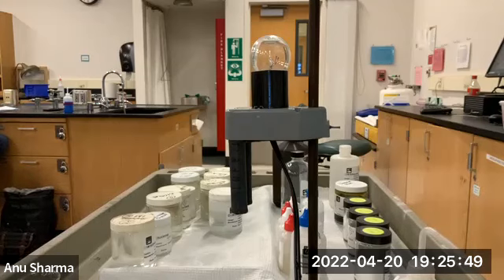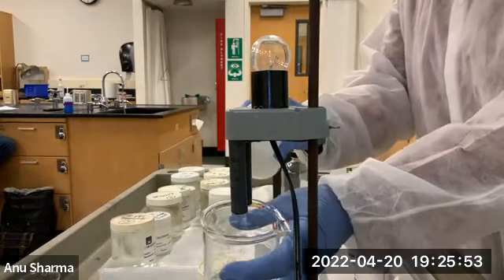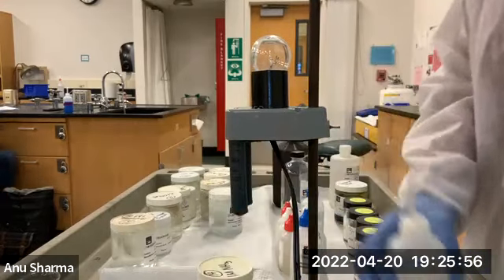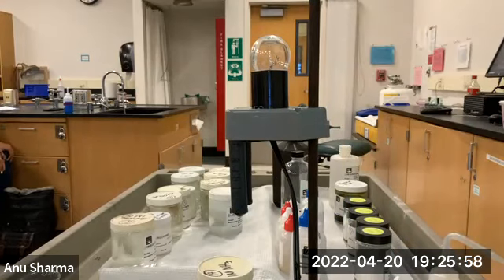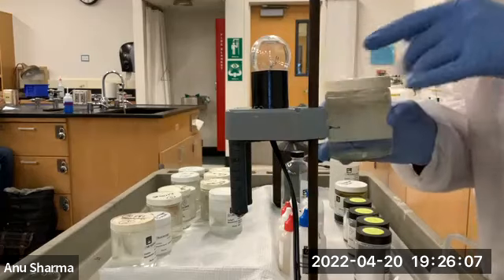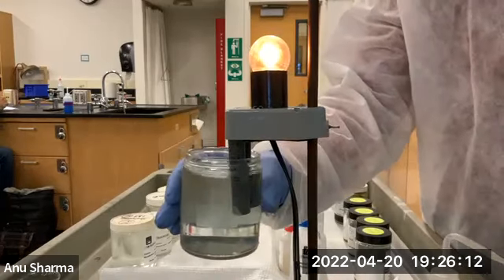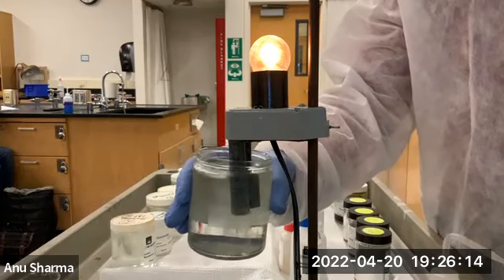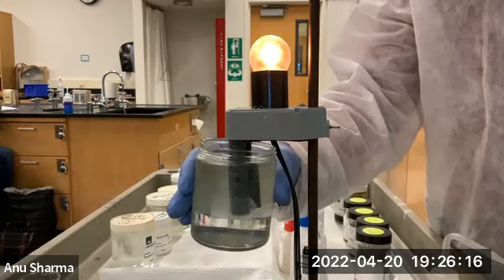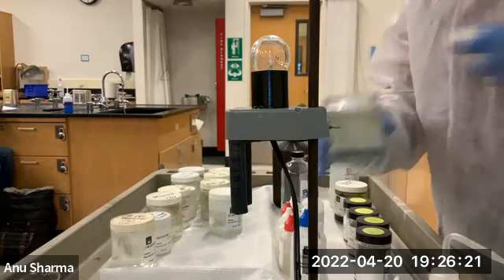Now let's look at ammonia. When ammonia gets bubbled in water, it reacts with water molecules and it forms NH4 plus ion. So let us see. Here, very weak electrolyte, but it is still conducting electricity. So there is ammonium ion and OH ions here.